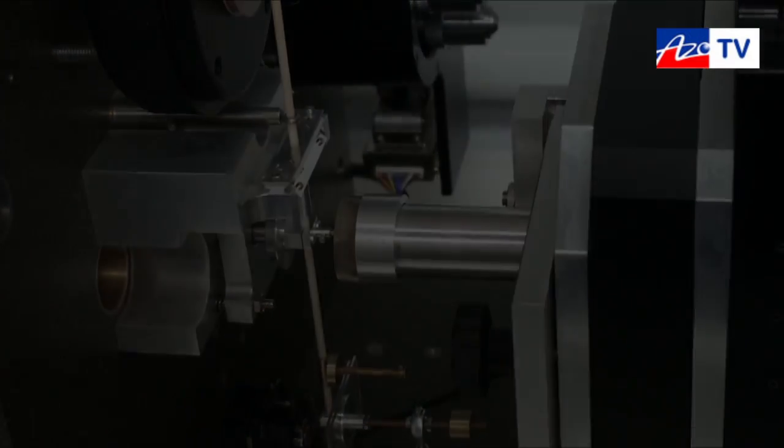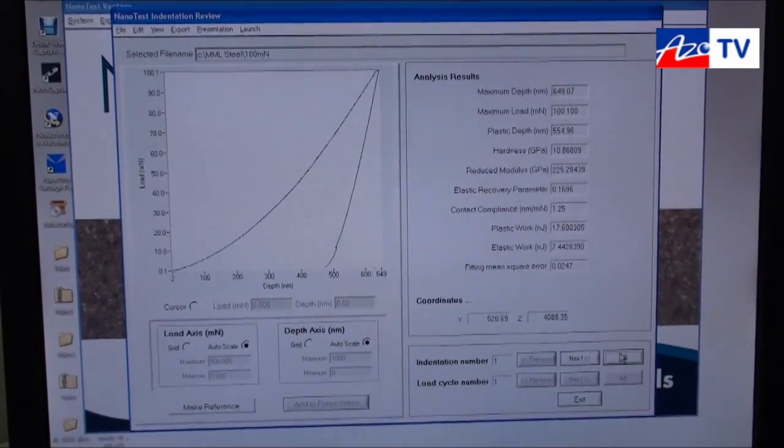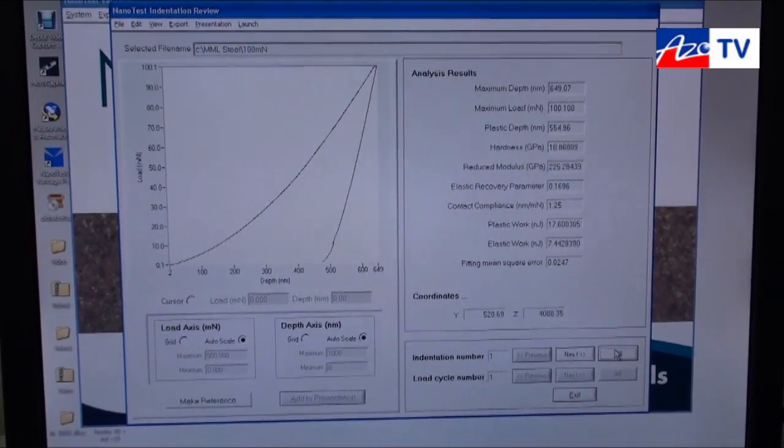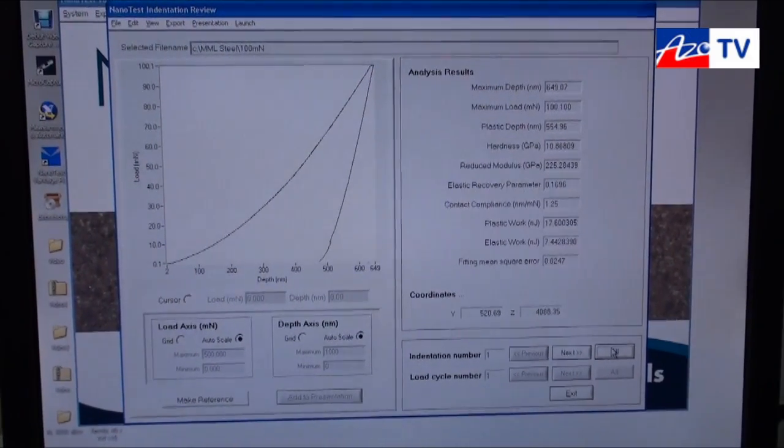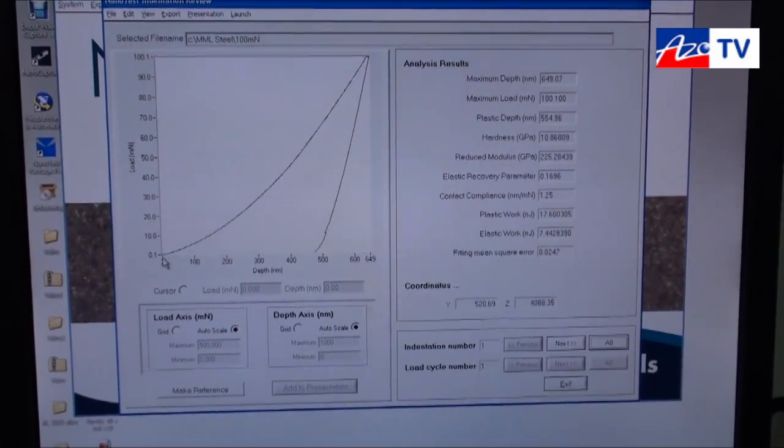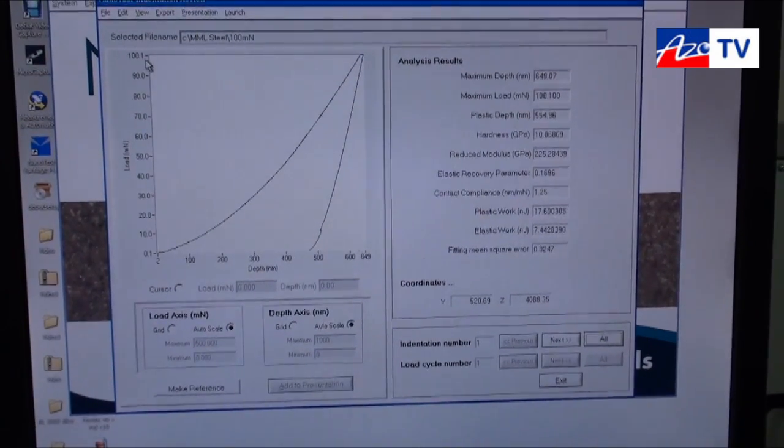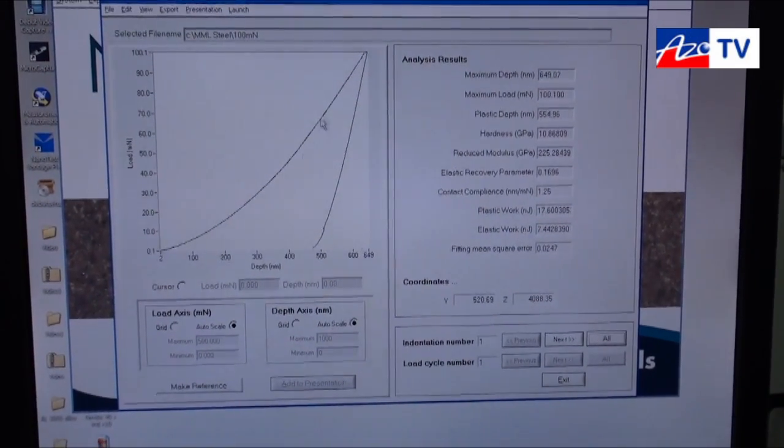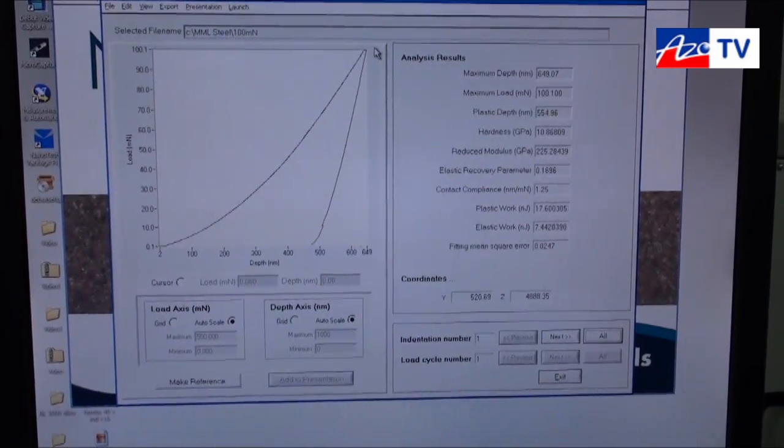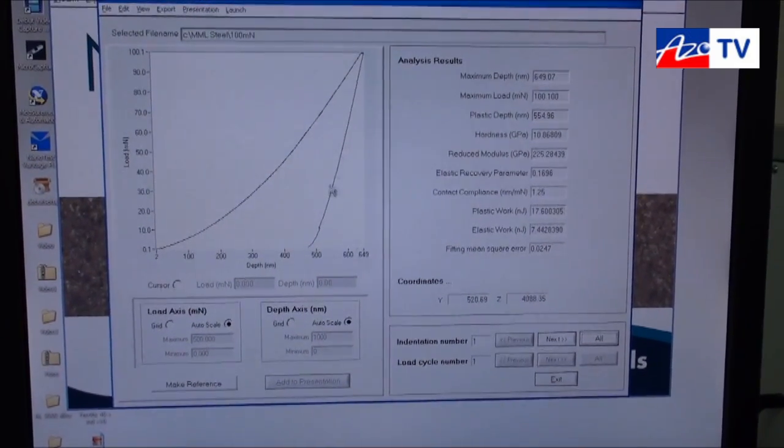It's just going to run through. This is a typical set of indentation data, actually taken from a steel sample, one of the samples we use here at MML for calibration. This is the plot of a single indentation. First we have the change in depth as the load is slowly increased, with load on the vertical axis here, up to a maximum load. We then have a hold at peak load to let any driven viscoelastic deformation settle down before unloading.